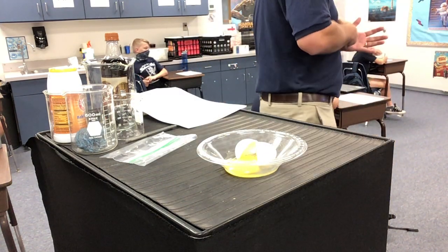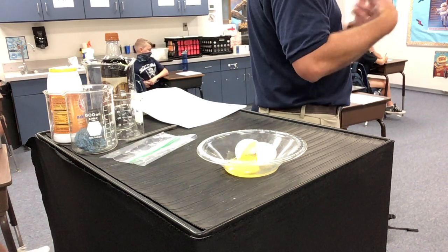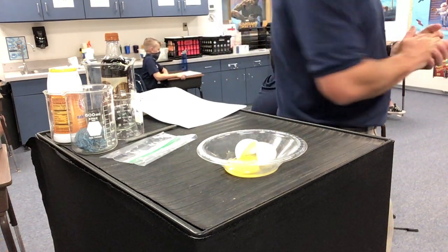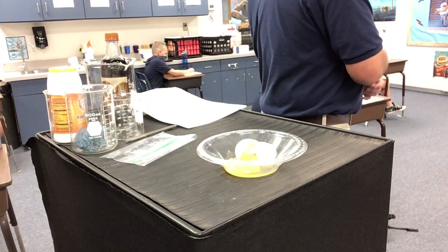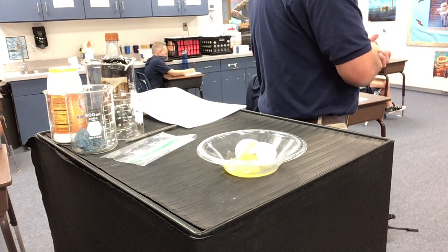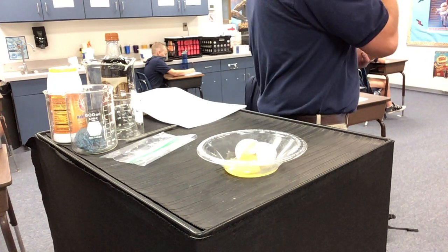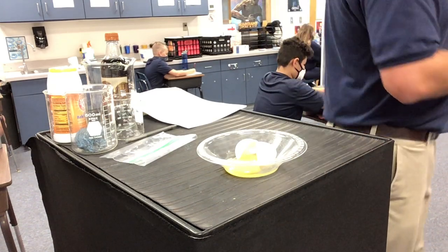And is there a new physical property? Did it change somehow? Change color, shape, texture, anything like that? At this point, you should be able to fill out the last column on whether it is a physical or chemical change. And you should be able to tell me what evidence proves why you picked physical or chemical change.